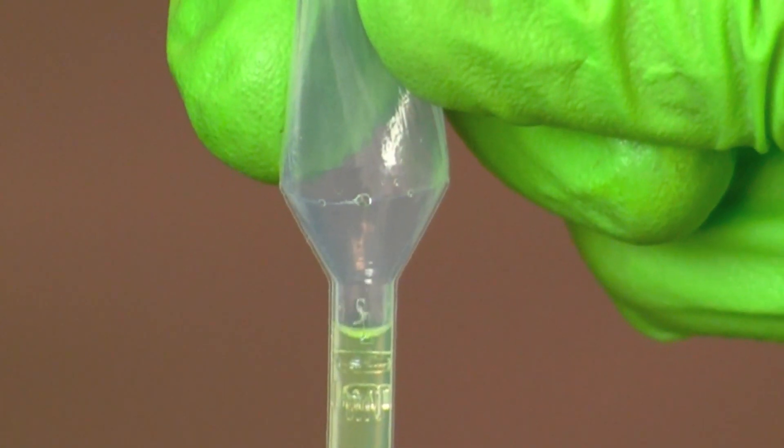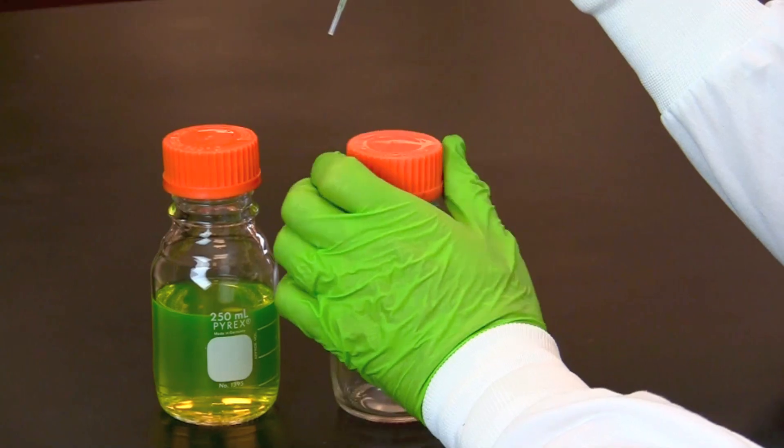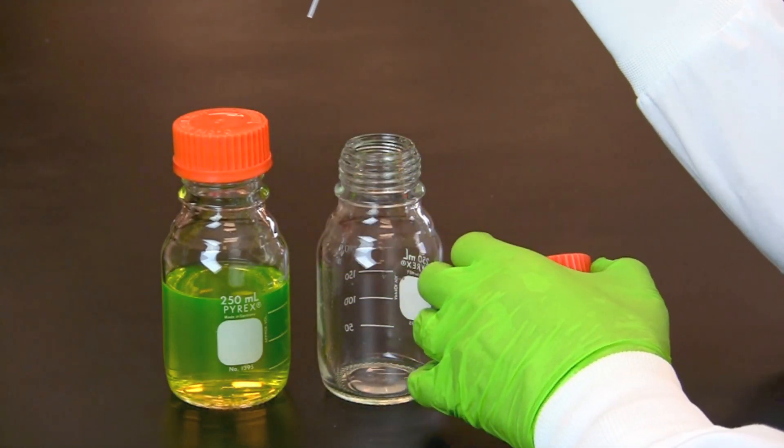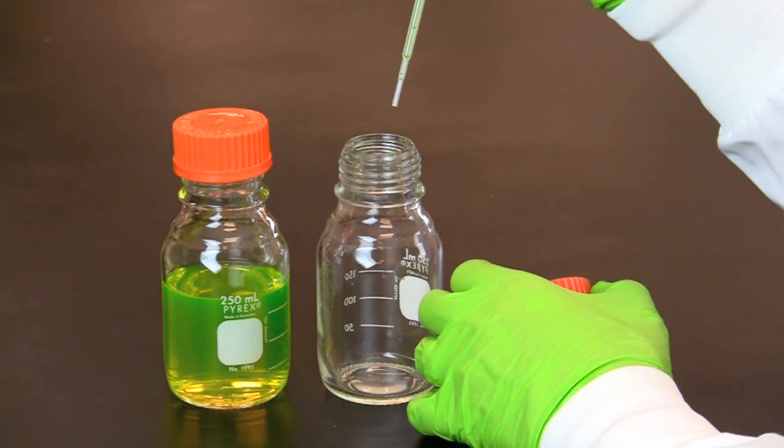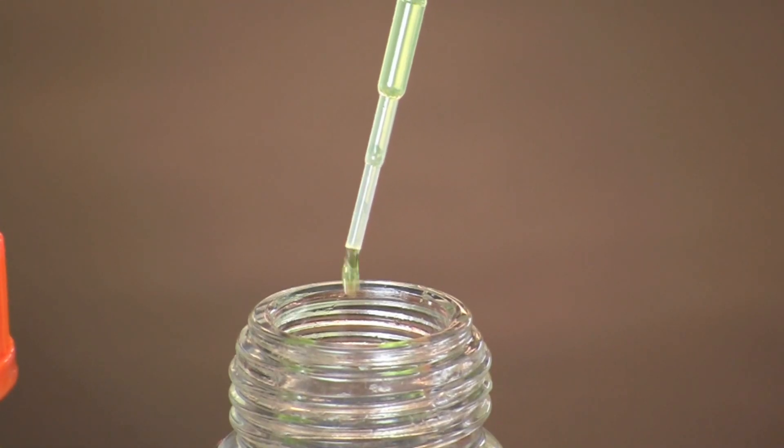Then slowly apply pressure on the bulb until the solution reaches the desired volume. Then holding steady pressure on the bulb, move the pipette to where you wish to transfer the solution and slowly apply pressure on the bulb to dispense the liquid.